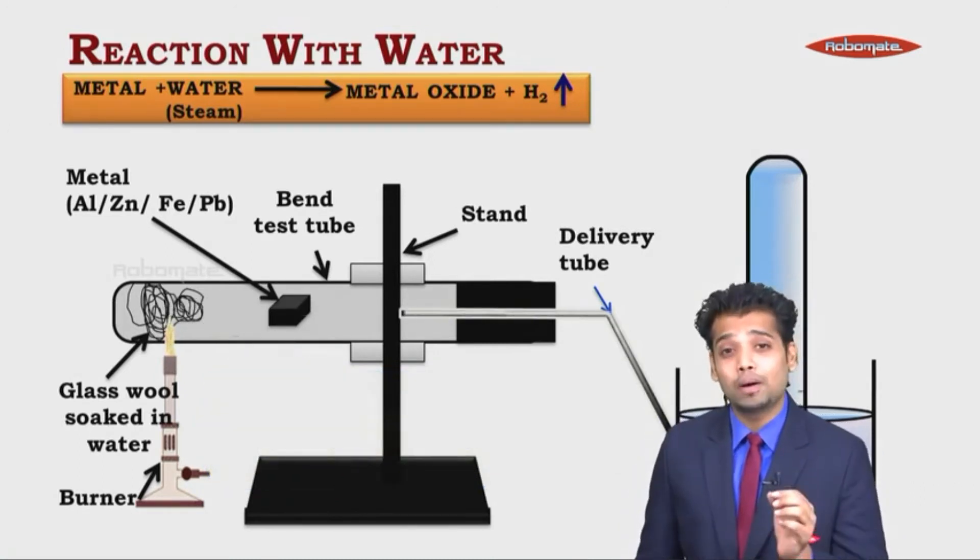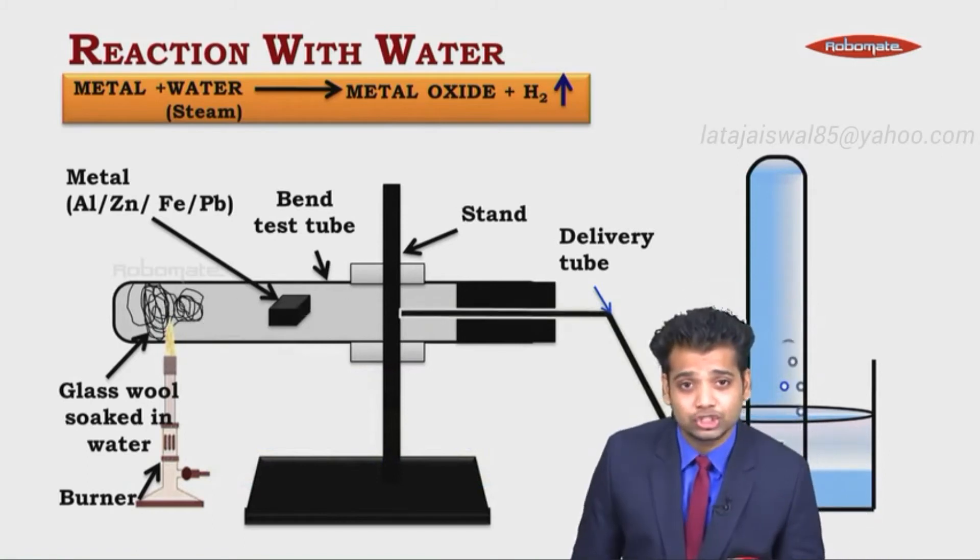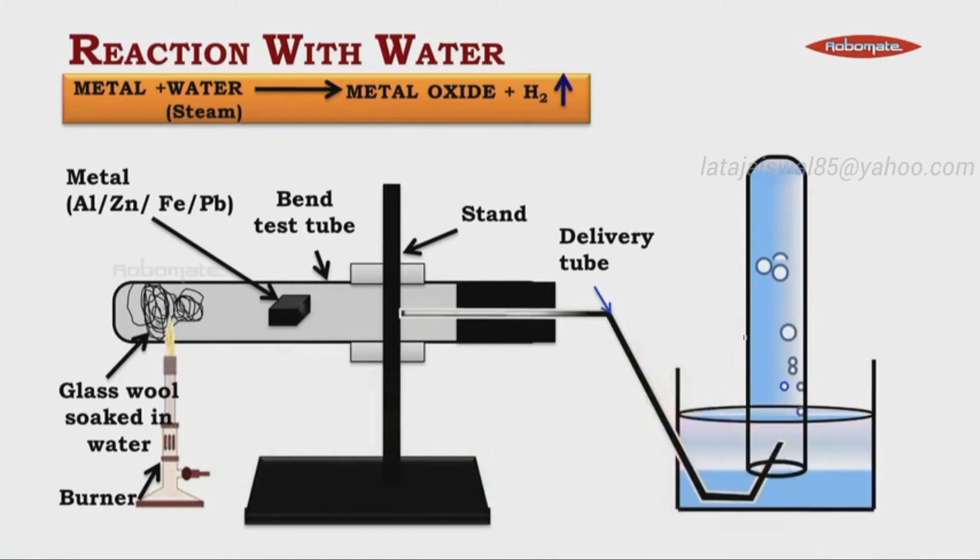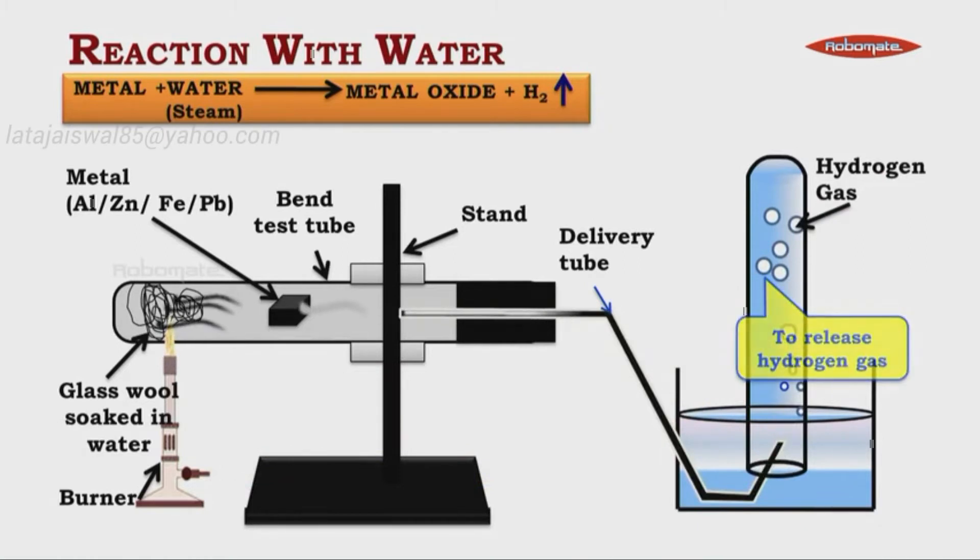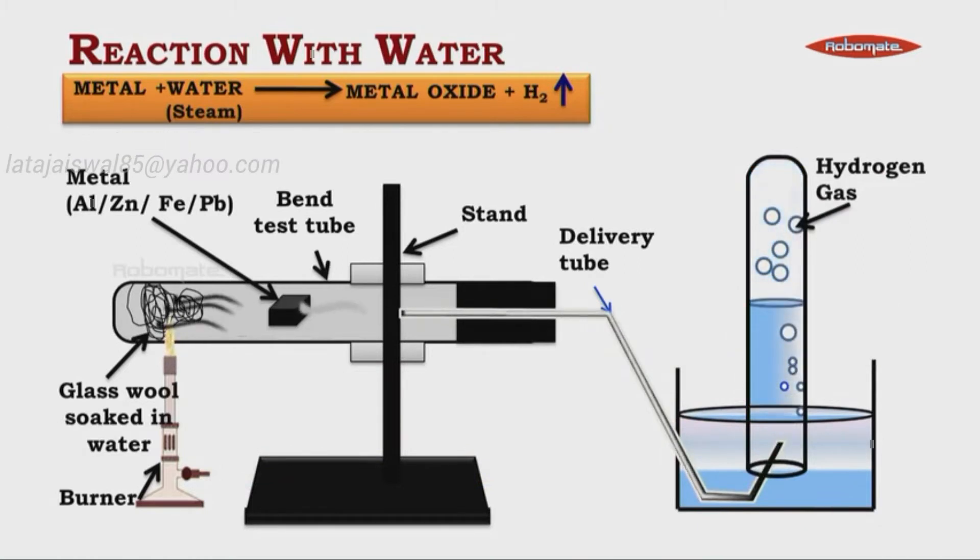You can see the delivery tube and it is going to travel into the test tube. Now when it does into the test tube, what happens is a lot of bubbles are going to be formed on the test tube. You can see there a lot of bubbles. What is going to happen is these bubbles are going to displace water and form a layer of gas. When it does so, hydrogen gas is trapped in the test tube. Hydrogen being lighter than water goes up.